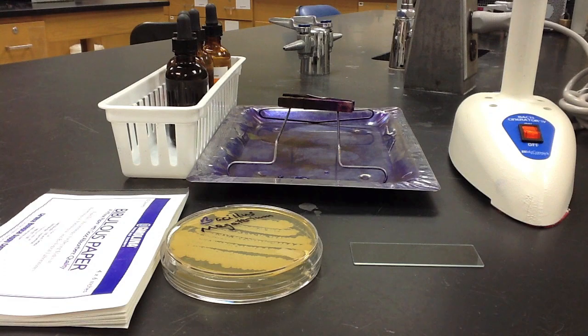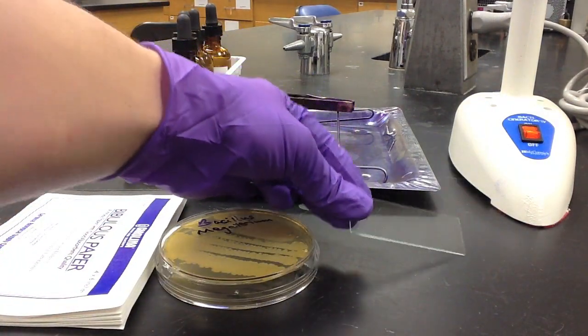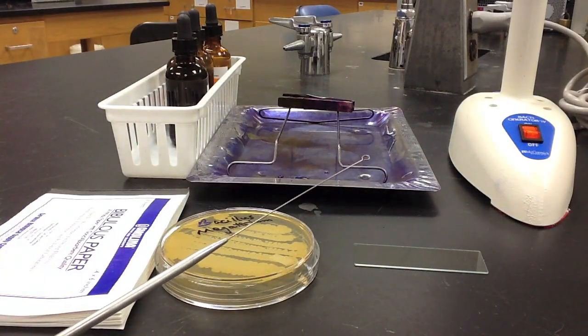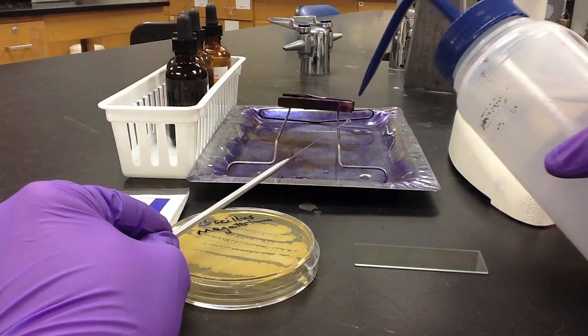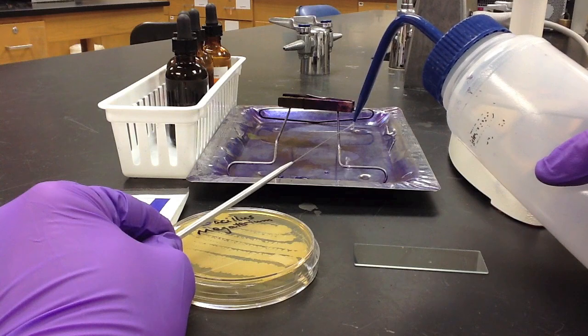We begin the Gram staining procedure by taking a clean microscope slide, an inoculating loop, and a bottle of deionized water. We'll spray the water through the loop until a single droplet is trapped, then place that single droplet onto the surface of the slide.